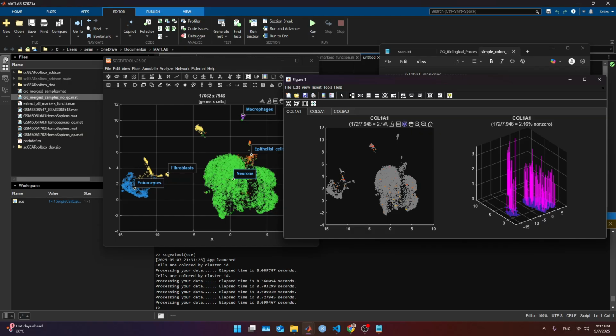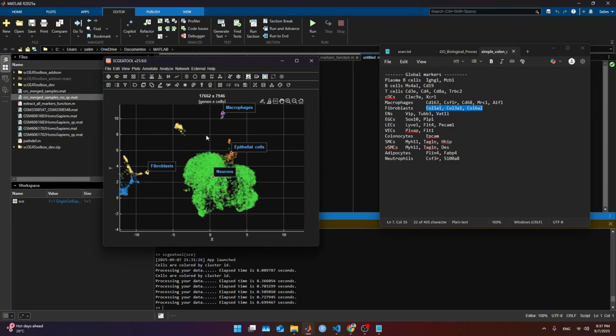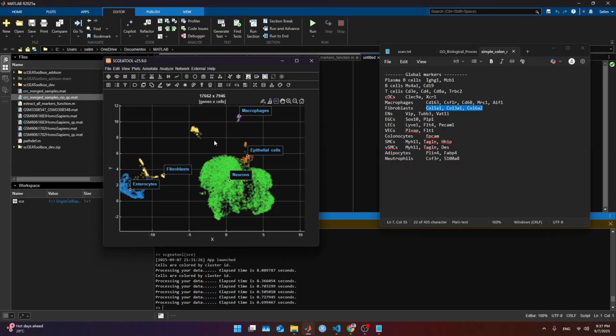So potentially those are not fibroblasts. But here in the middle, it's potentially fibroblast. If we look at Col3A1, again this in the middle, so this is definitely fibroblast. Here, maybe not all, in the bottom left. And again, Col6A2 verifies that. So very likely, this selection, let me just brush mark. All this selection is potentially fibroblast.